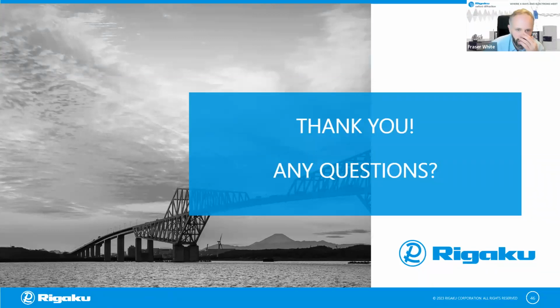The next question is, what is the limit for the vapor pressure for the vacuum seal? Would it be possible to introduce, for example, terpenes into the system and still get readings? Also, could you freeze compounds that are liquid at ambient temperature on the sample holder and work from that? And thank you very much for the interesting presentation.